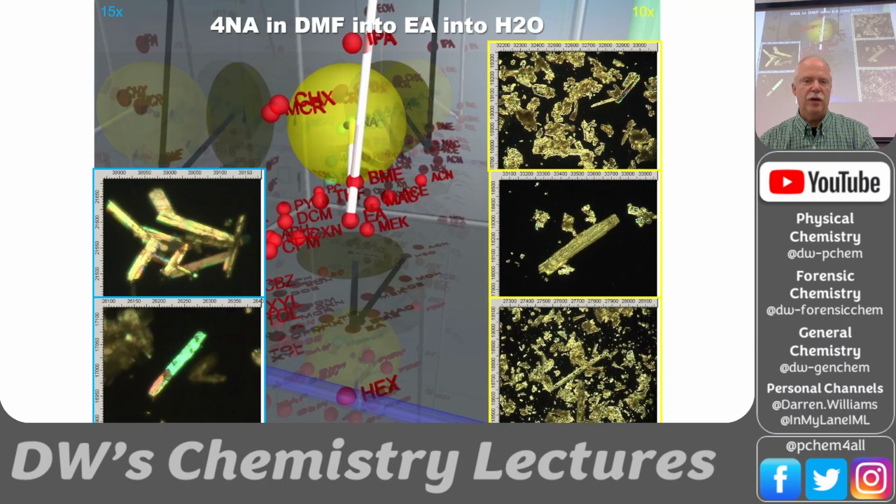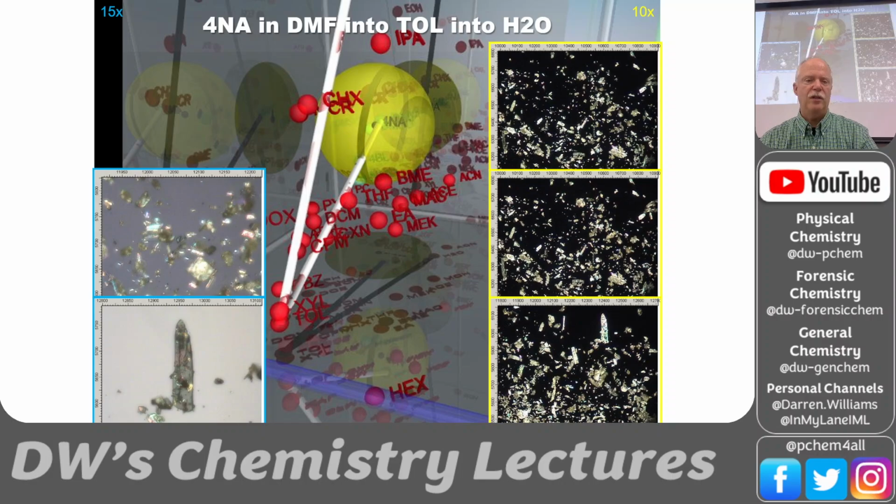And then when we go to ethyl acetate, the crystals are not as pure. Okay, so we're losing some of that polarity. We're losing some of the stability of the faces. And then when we go to toluene, it's terrible. We got gravel with toluene. It's so insoluble in toluene, we get really rapid nucleation and almost no growth. So we're not stabilizing any of the faces.